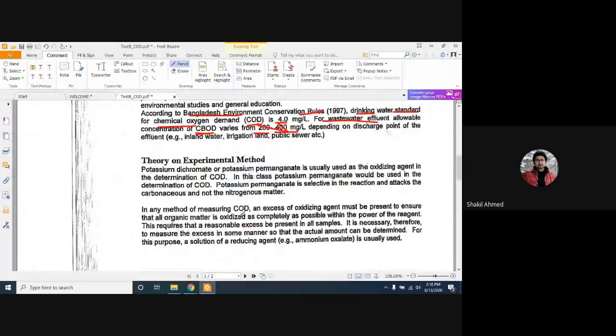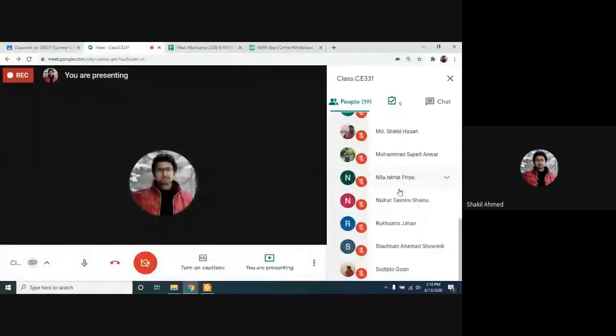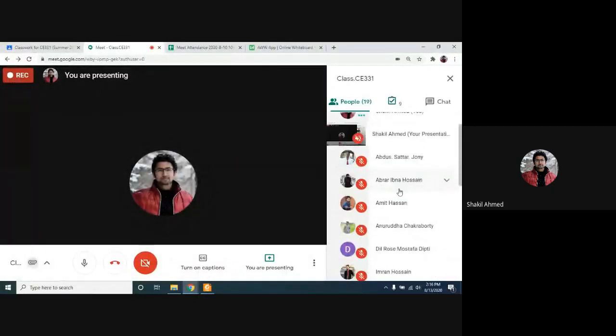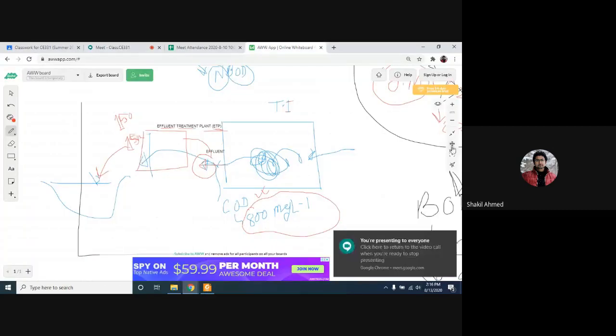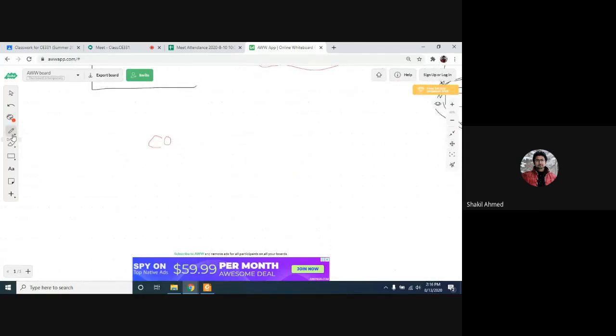Okay, so what we are going to do here is determine COD. How we are going to do it is very easy. We have organic matter, we will use potassium permanganate, and we will do titration.